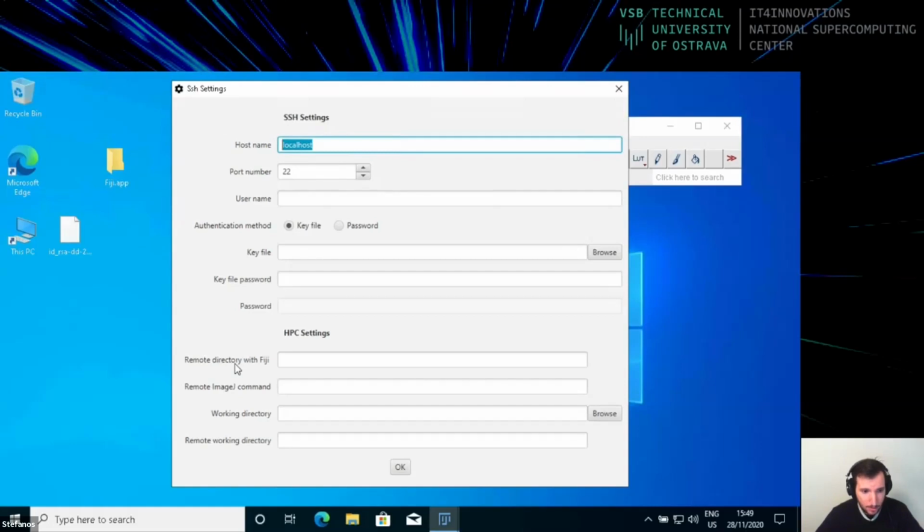Here now, I would like you to scroll down in the worksheet, and you will find that there is an actual table under the image of this window. In this table, you can copy paste all of the details, but you will need to change specific values. So I would like you now to copy paste everything from that table to this form, and I will also fill this out, and I will mention which fields you will need to change with what values.